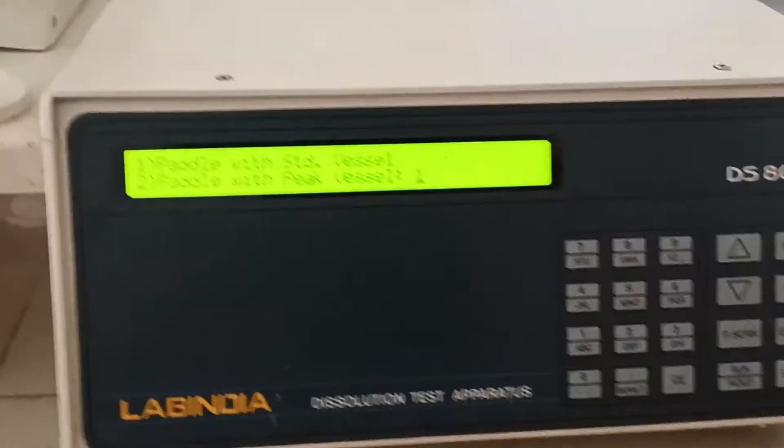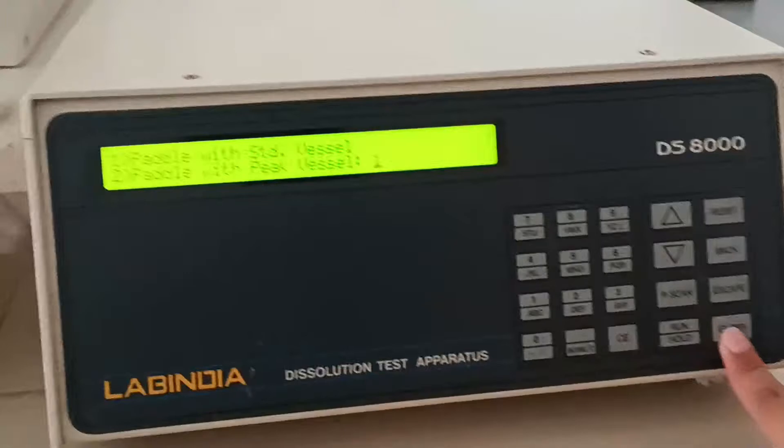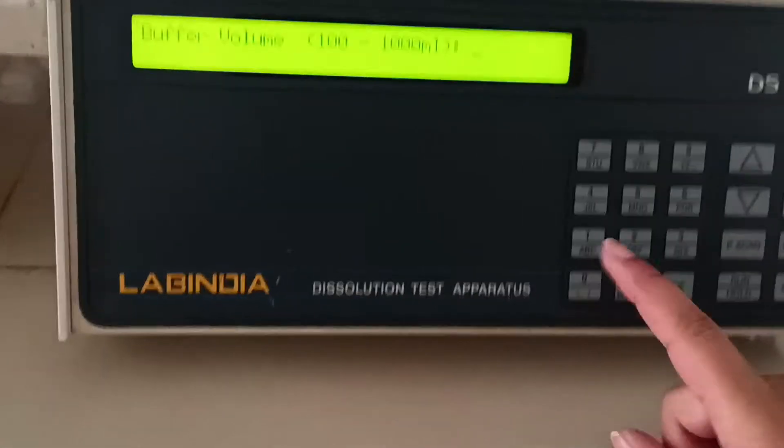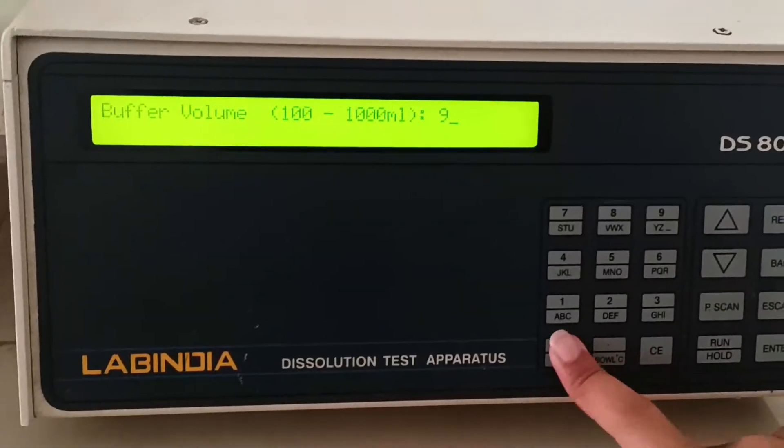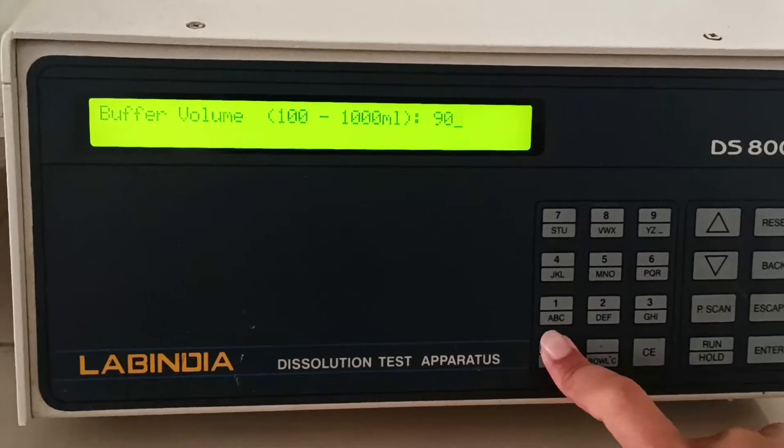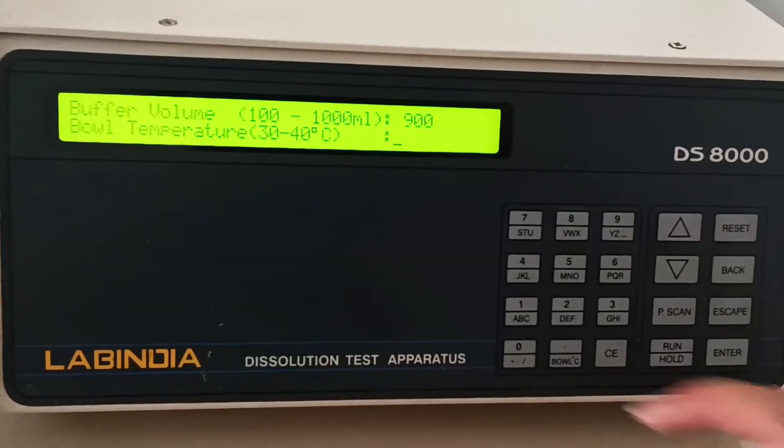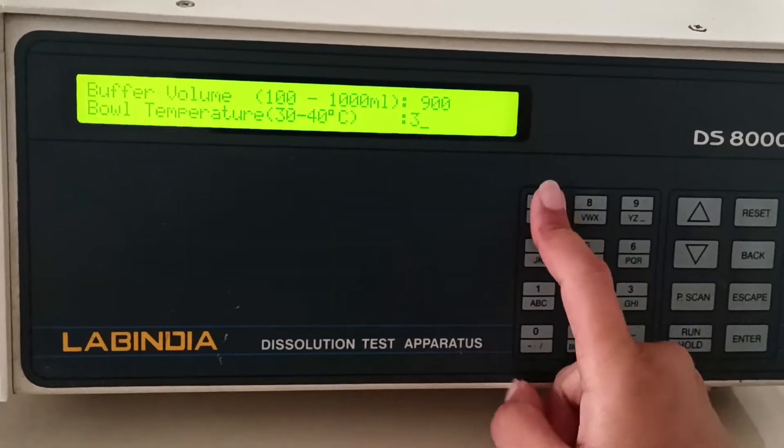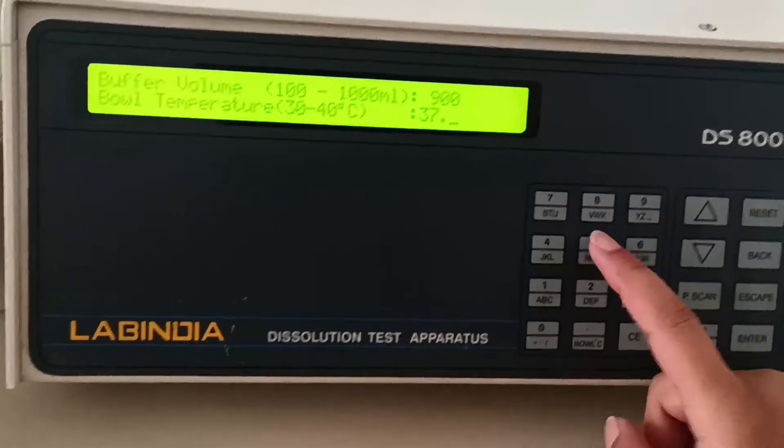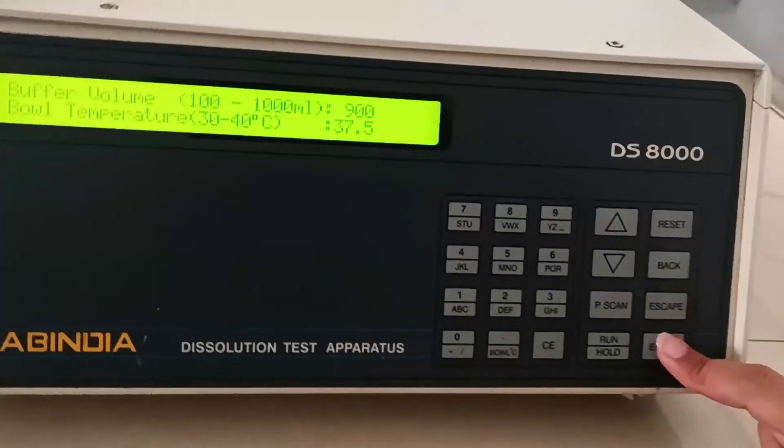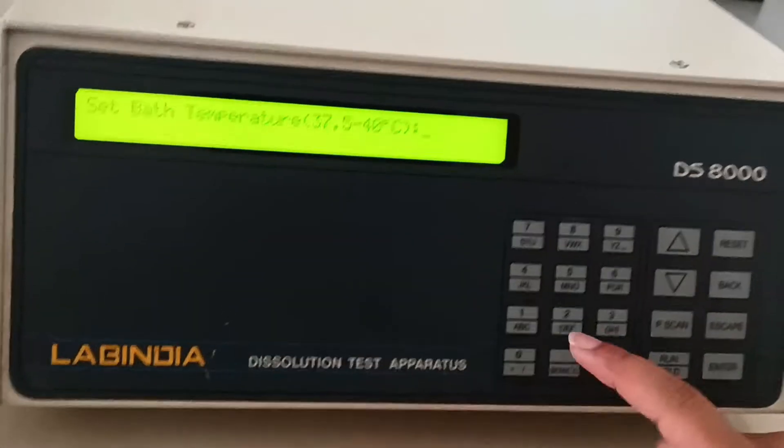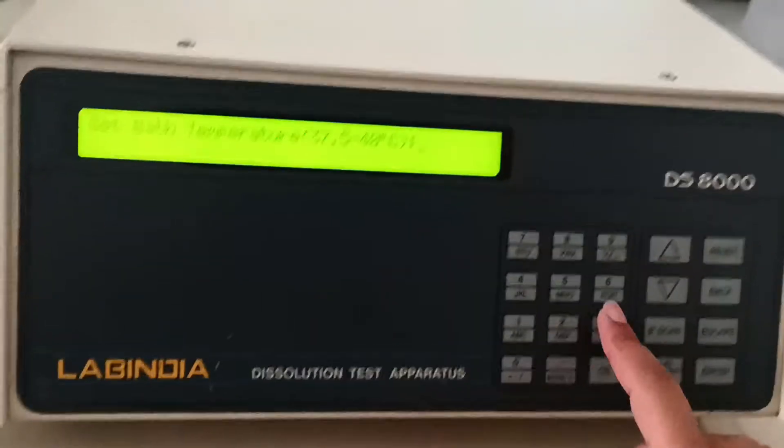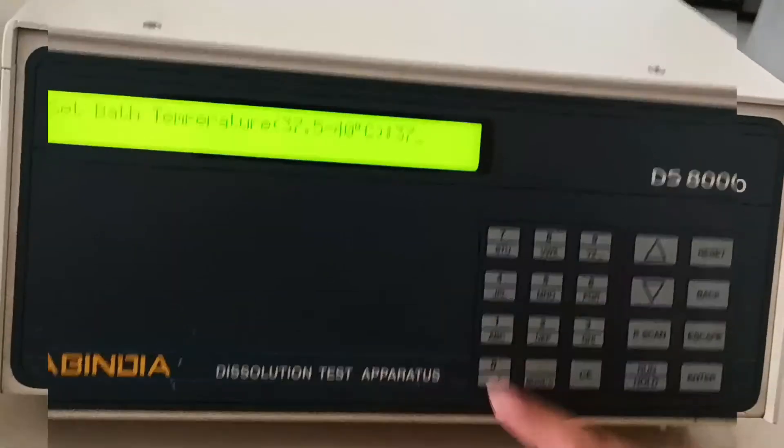Then press number two because in the paddle the vessel strength is number one. Set the strength to 25. Then enter how much buffer volume you want - 900ml. For temperature, enter how much you have implemented, like 36, 37, or 37.5.